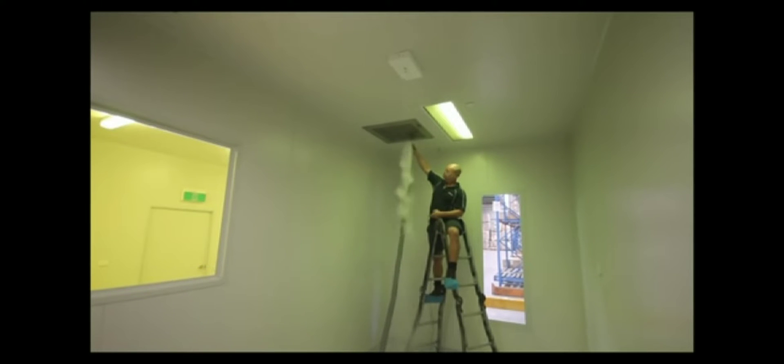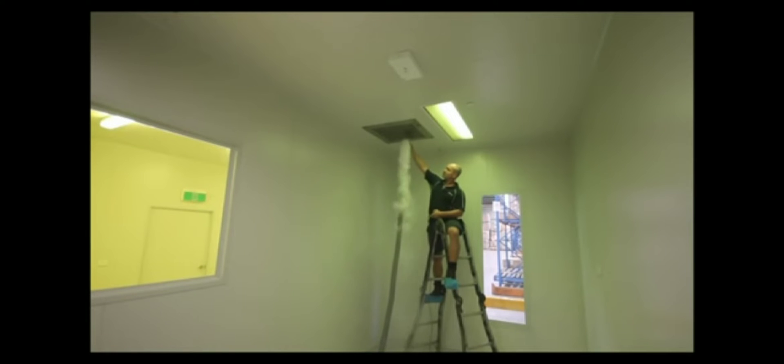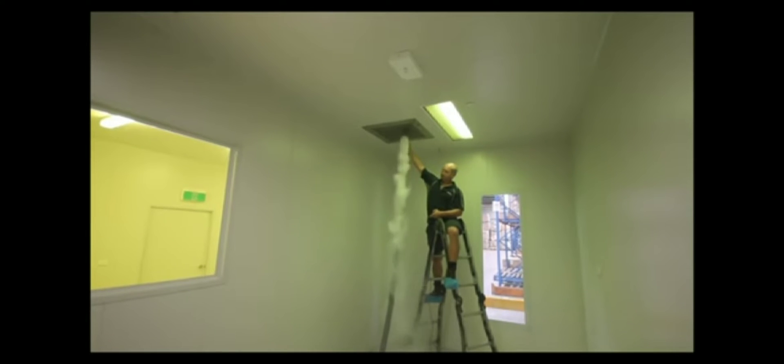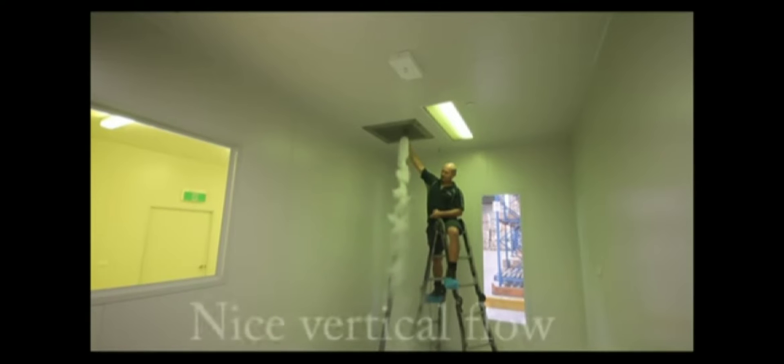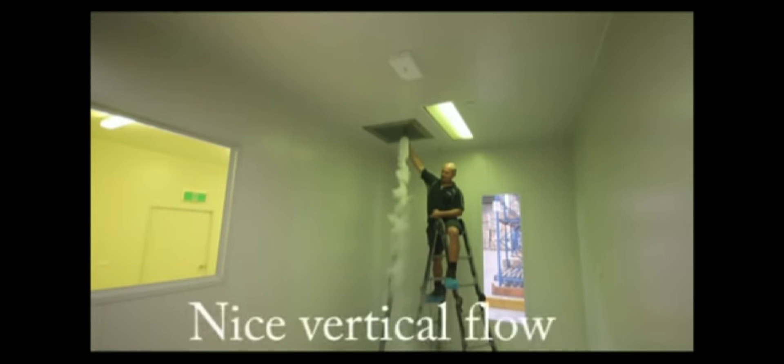Now there is some laminar flow within this clean room which is coming directly out of the HEPA filter which is to be positioned directly above a production area once the machinery is in place.